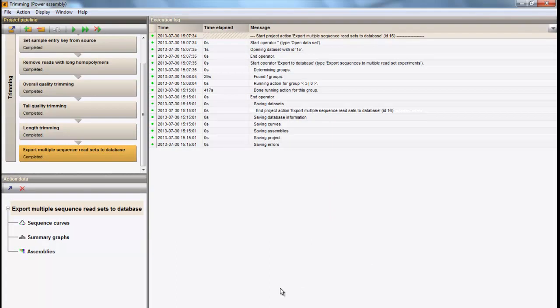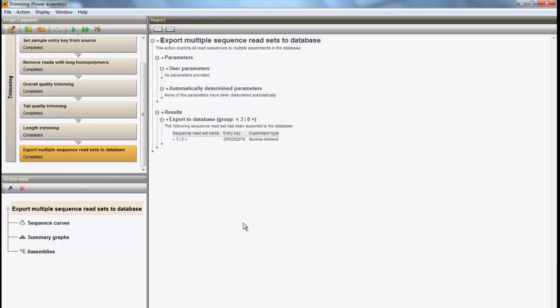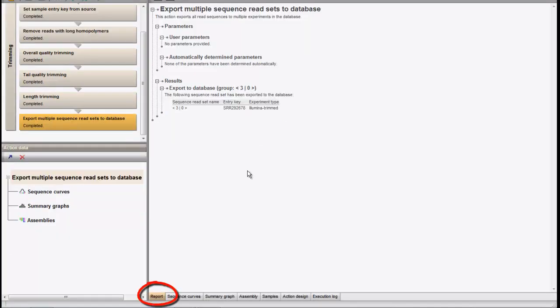There is an easy way to manually interfere with the trimming. One can change the parameters for trimming, or even alter the trimming pipeline from the power assembly analysis window. As an example, we can change the parameter for the minimum quality and we can exclude the tail quality trimming.